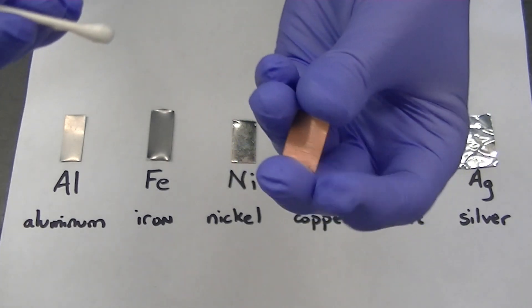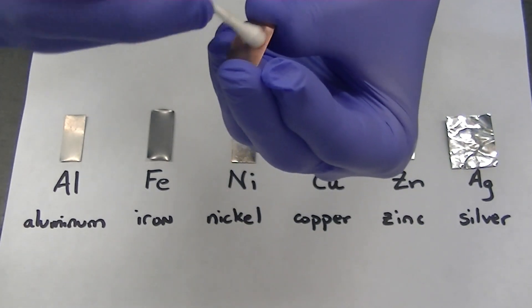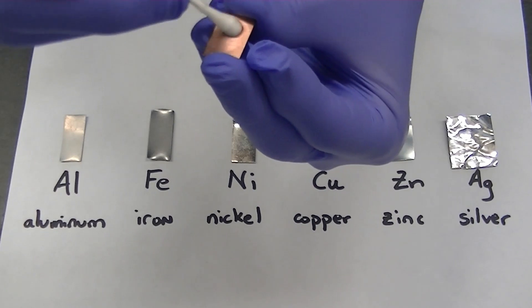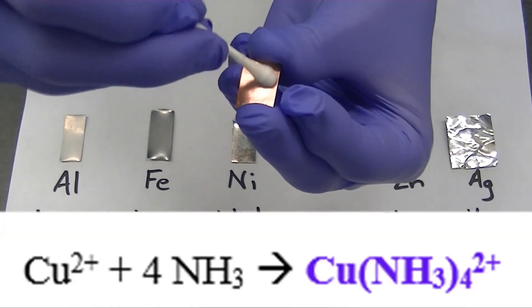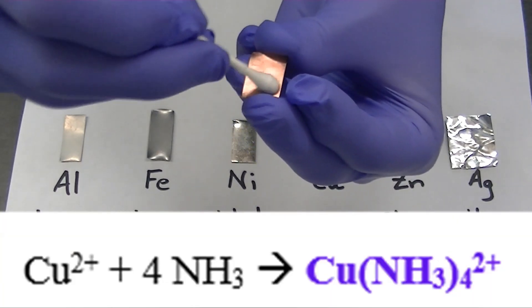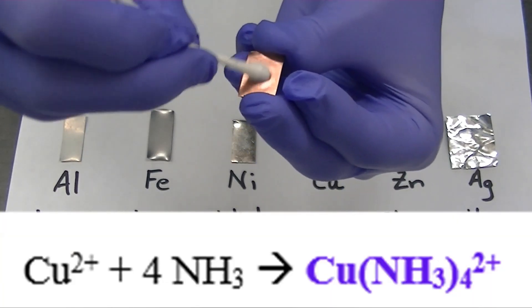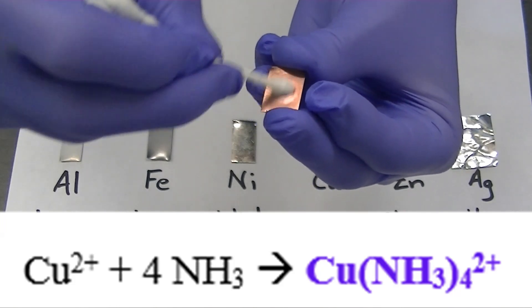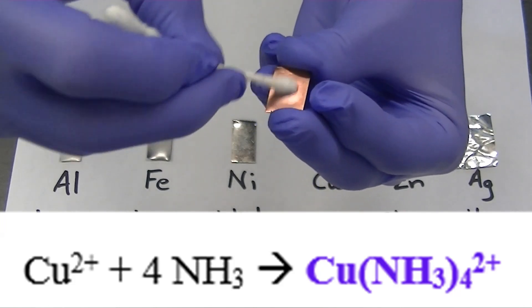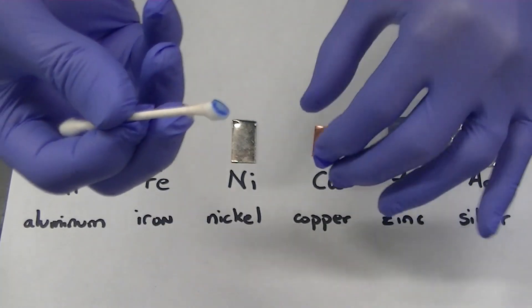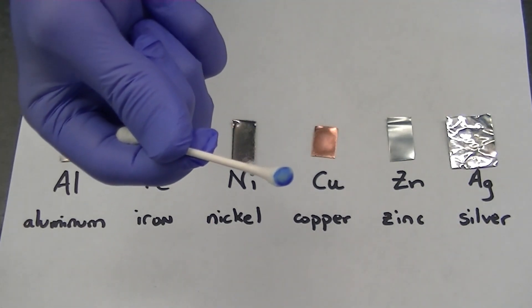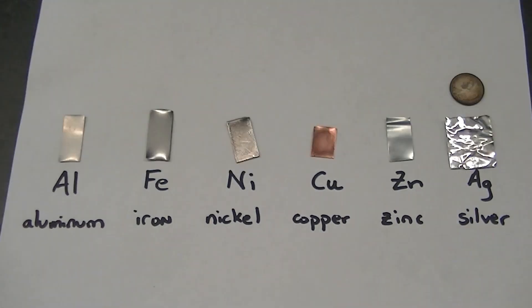I'm going to rub this Q-tip that's been soaked in 15 molar ammonia over the surface of this copper strip. Any copper ions present on the surface of the copper metal will react with the ammonia to form a blue colored complex. The vibrant blue color observed here is a positive test for copper.